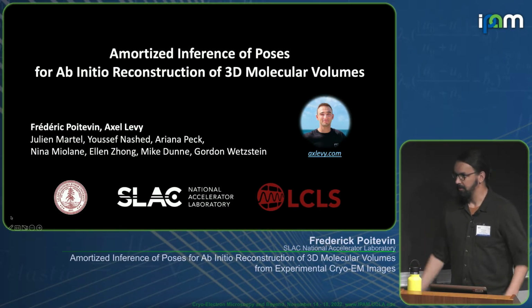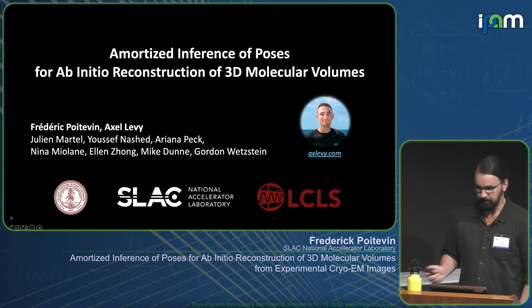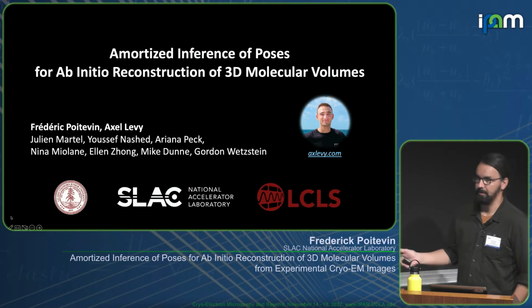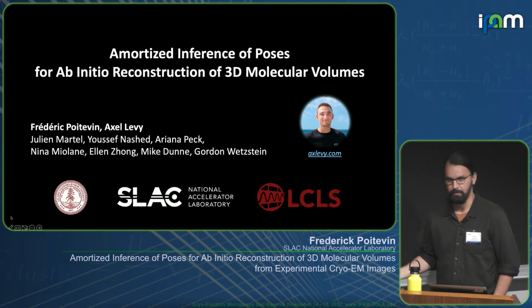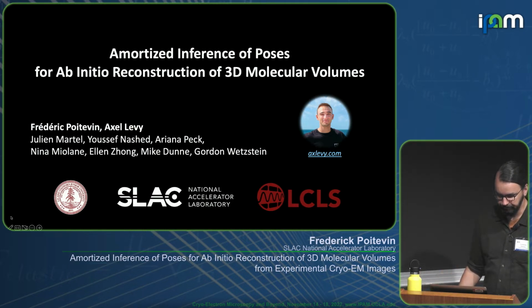You heard the big picture of CryoDragon on Monday, so I'm just going to zoom in a little bit on some little aspects. But yeah, so the idea today is to talk about amortized inference, and if you're not familiar with it, hopefully by the end of it, you'll have a picture of what that means.